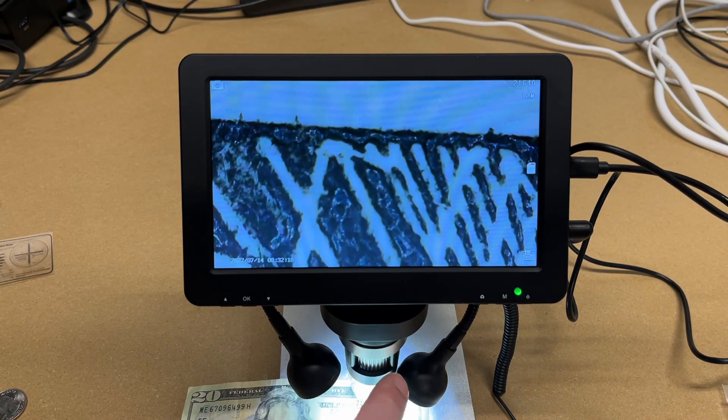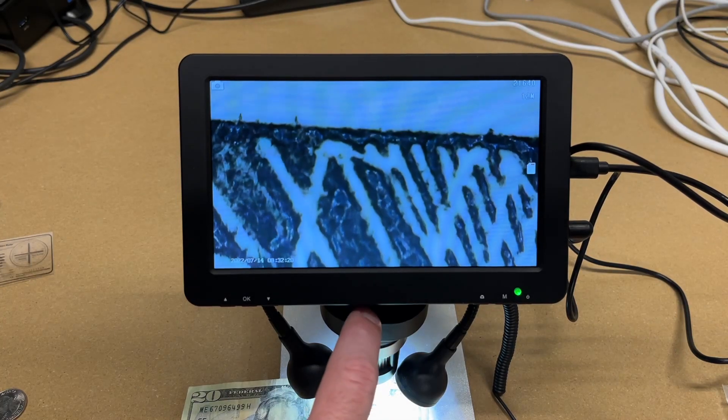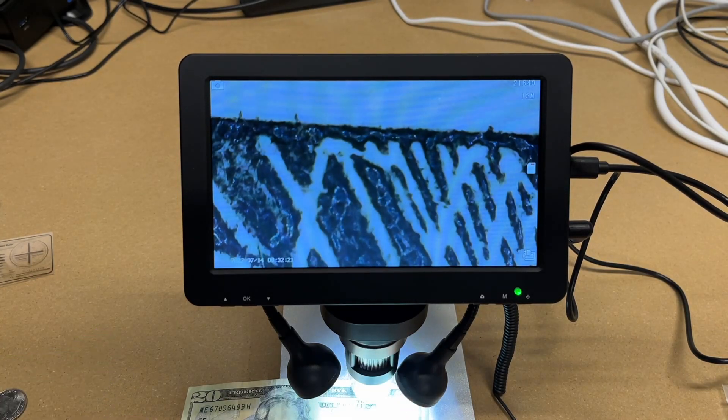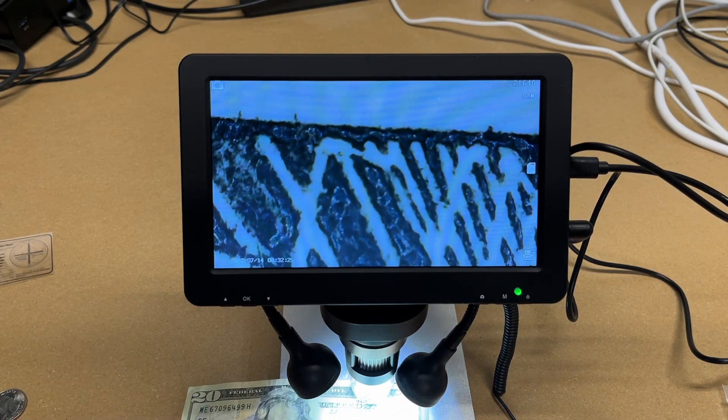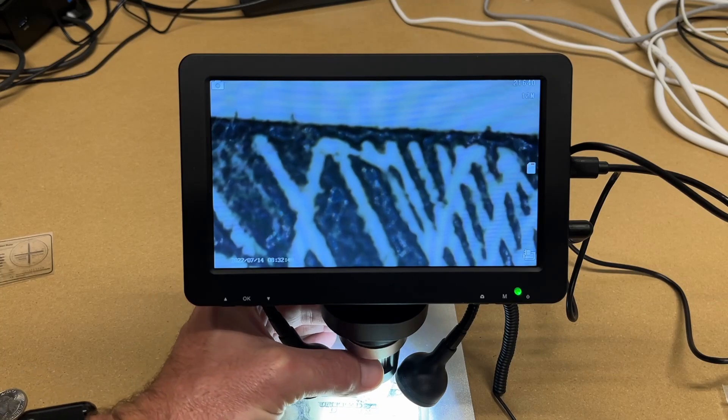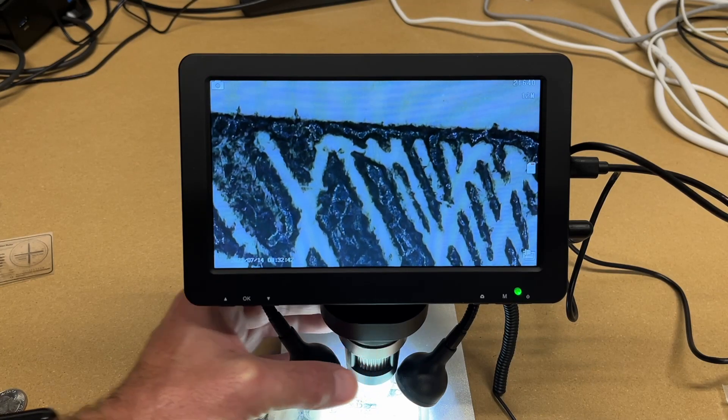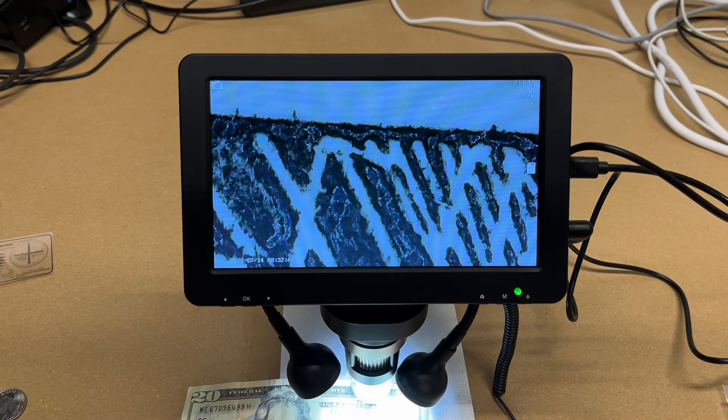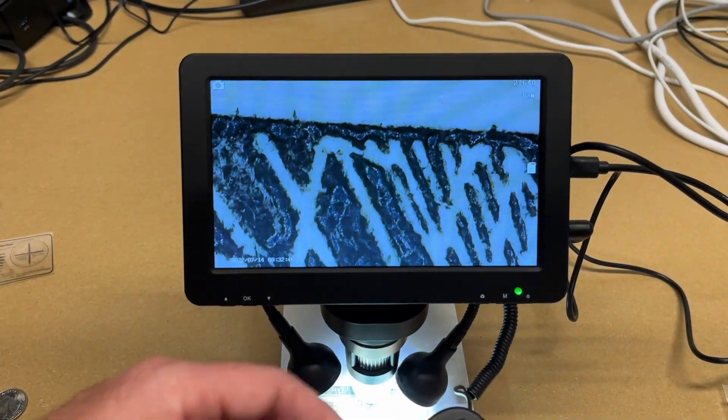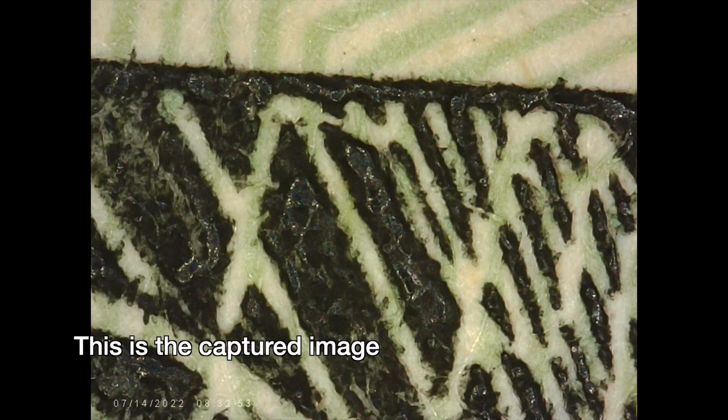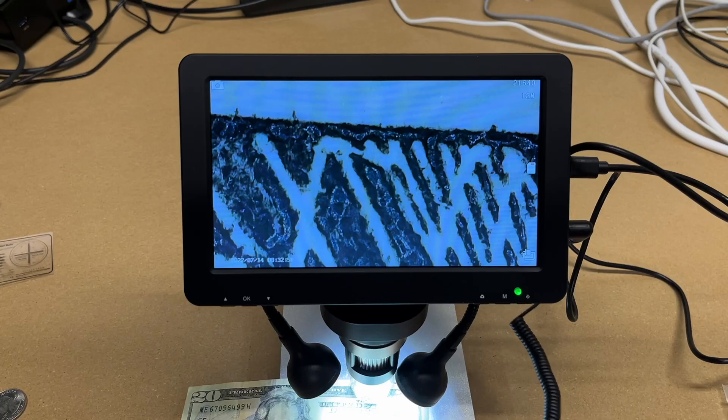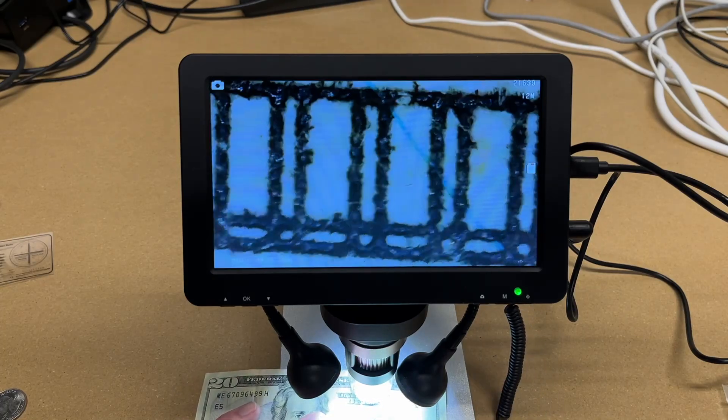So here we have a picture of the money. And we can hit the OK button on the remote and snap a picture. So let's look at another part here.